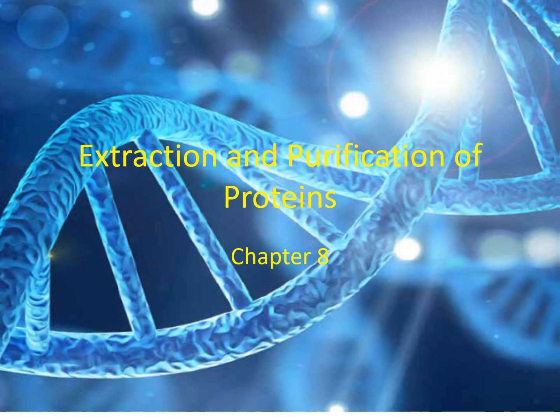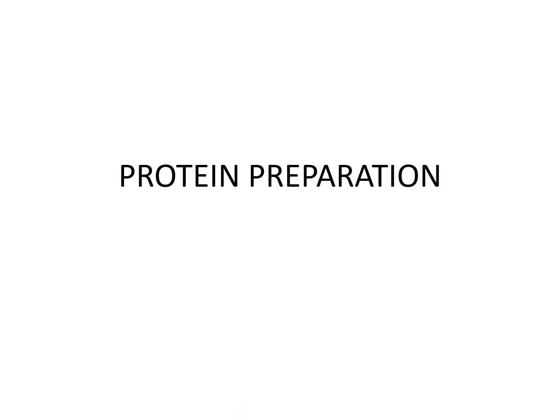In the previous two chapters, chapter 6 and 7, we discussed how to prepare the DNA from the cells and also how to evaluate the DNA quantity and quality. And now in the next two chapters, chapter 8 and chapter 9, we will discuss how to purify the protein from the sample and how to evaluate the quality and quantity of the protein. So chapter 8, the protein preparation.